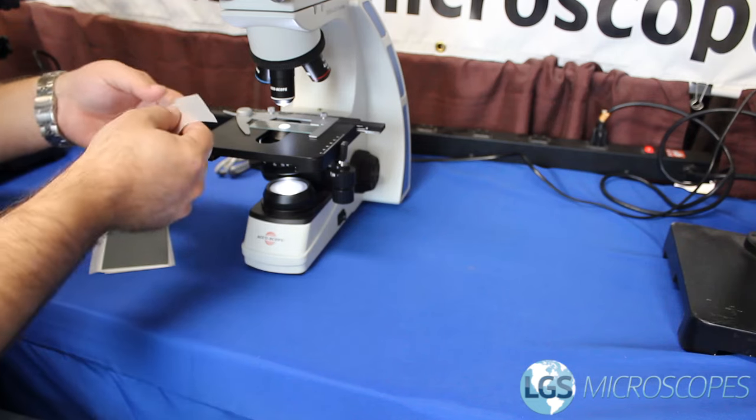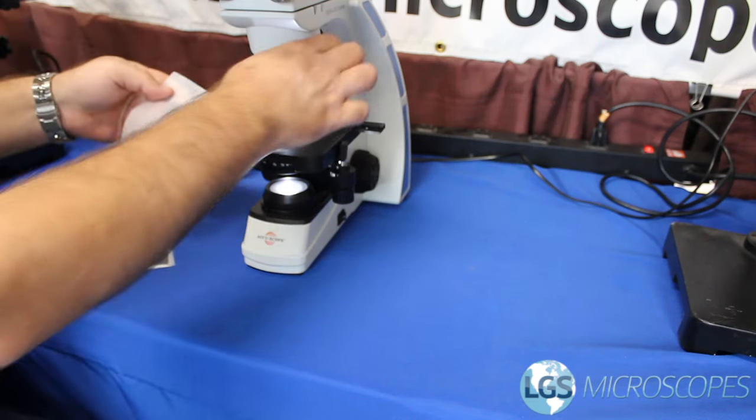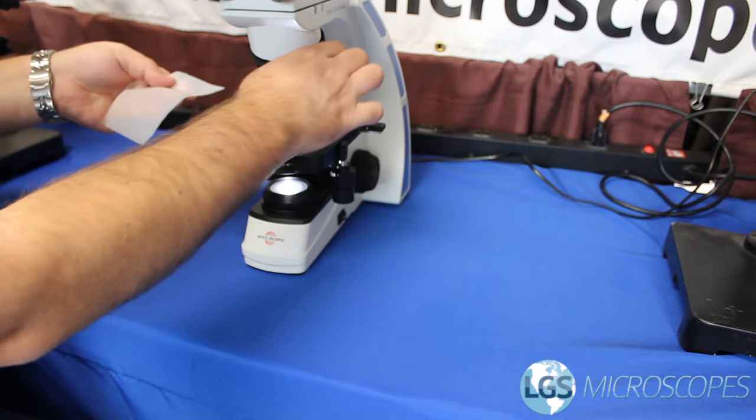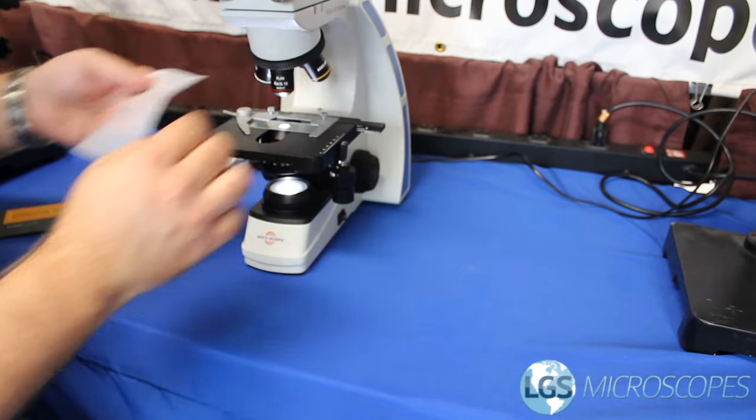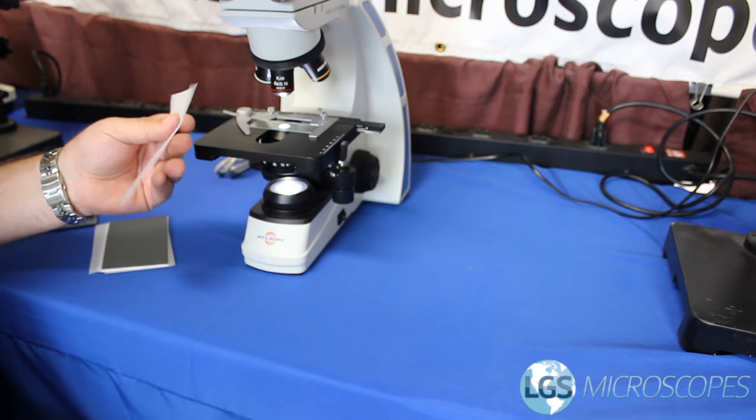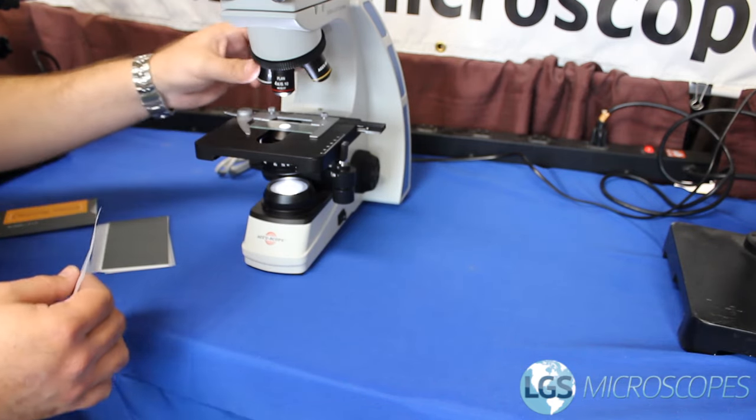There are a lot of videos and tutorials out there on how to use immersion oil but there's actually a lot of things that they tell you to do that's incorrect. For example they'll tell you to wipe off your 100x objective, then your 40x, then your 10, and then your 4. And really all that's done is just share the oil all over all of the objectives.